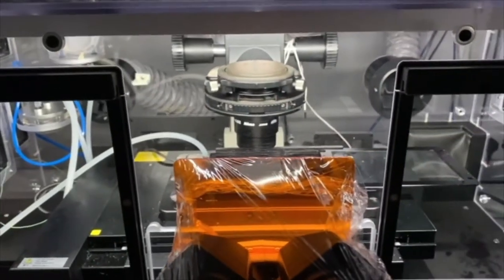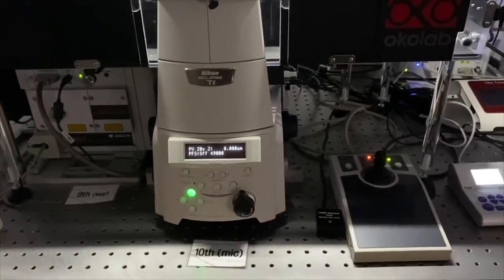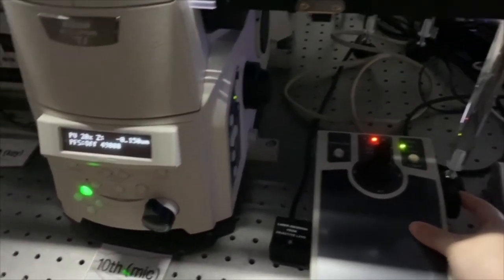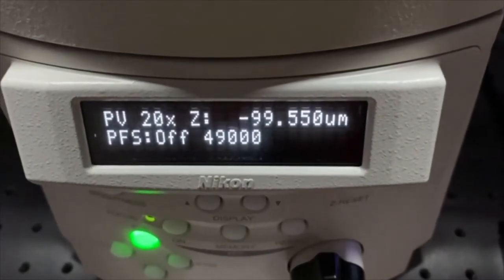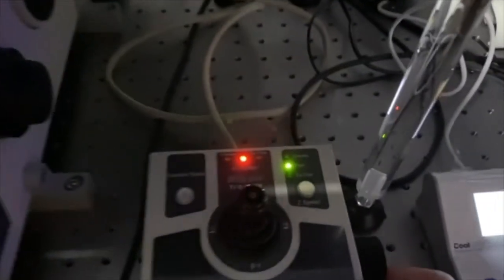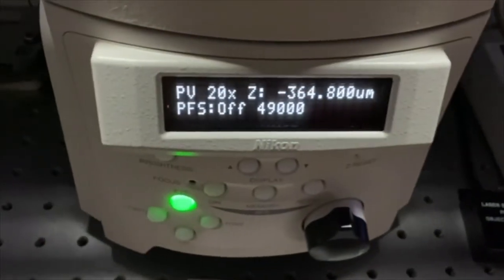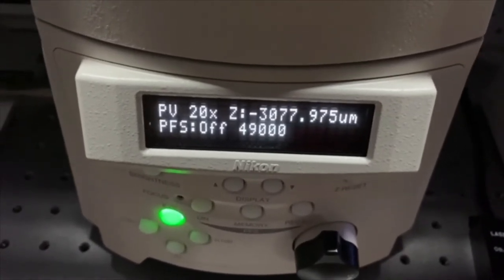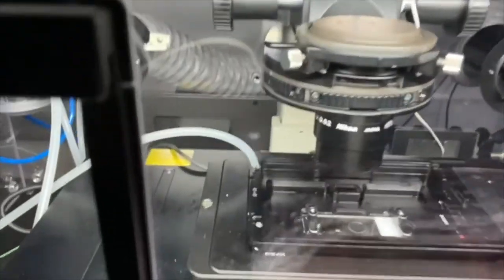Before switching lenses, please make sure you lower the lens all the way to the bottom. Put your hand on the wheel, turn it away from you — check which direction you're going by looking at the number going down. Once you know which way you're going, put it on course and lower the lens all the way to the bottom until the number stops moving. Now you can take your sample off.